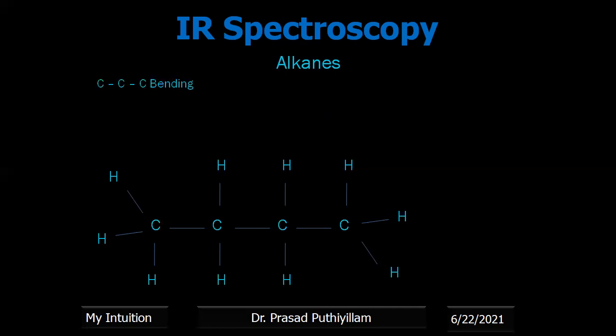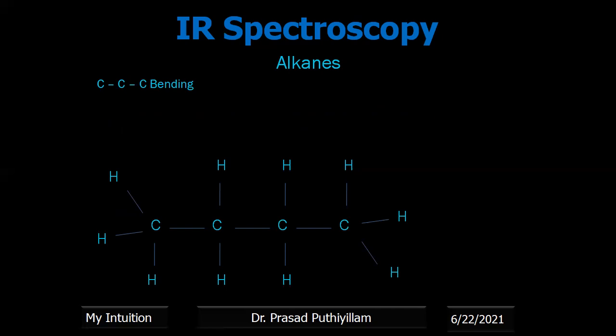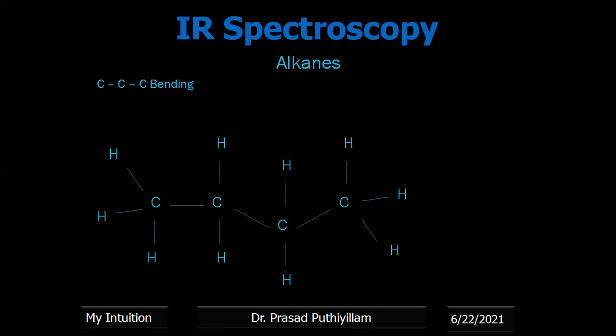It will be almost all hydrocarbon. Whatever IR spectroscopy we take, we'll be getting a very weak band in that region. The other one is bending, the carbon-carbon-carbon joint where it undergoes bending. So it may be bending on both sides, three-dimensional. I'm just drawing the two-dimensional representation here.